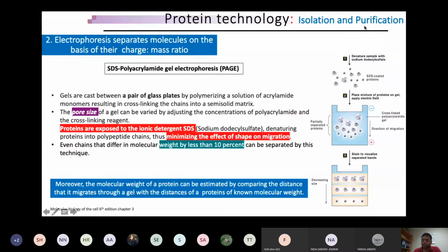You will not be able to separate any specific protein by either of these techniques, but you will be minimizing the noise in a way, because you have put a window, a constraint, on the basis of size or molecular weight. So all the rest of the proteins are gone. Then there is a second strategy which we normally use for proteins: electrophoresis, which is done on the basis of charge to mass ratio. This is the characteristic this technique focuses on.